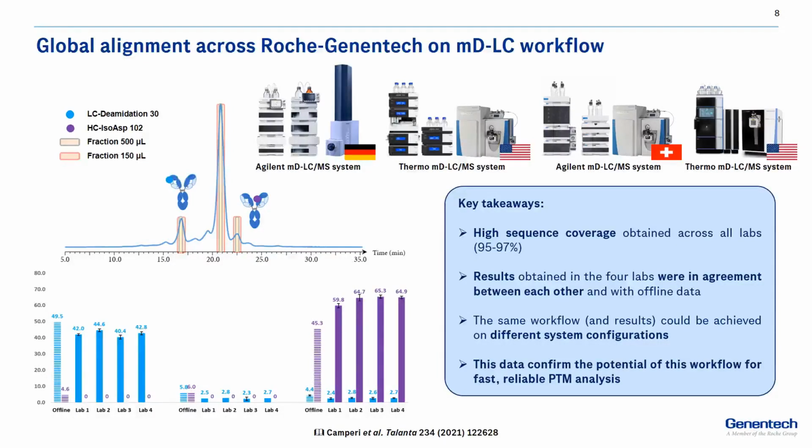The results obtained in the 4 labs were in agreement with each other and with offline data. So this data confirms the potential of this workflow for fast and reliable PTM analysis.